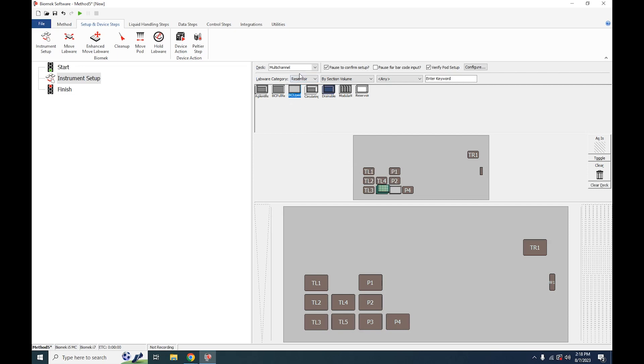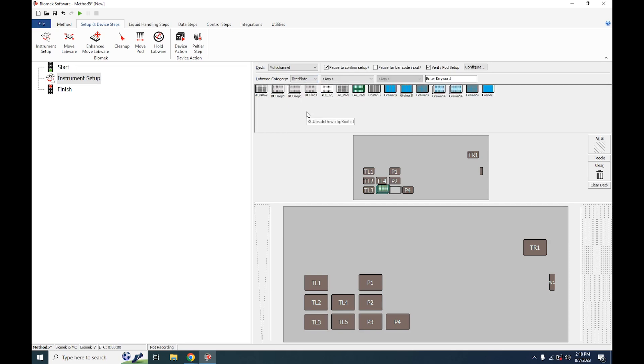After that, we're going to define our final spot on the deck, which is what we will be dispensing into, which is our titer plate. Under the titer plate we will select what we're using, which is going to be a flat 96, and drag it into position four.